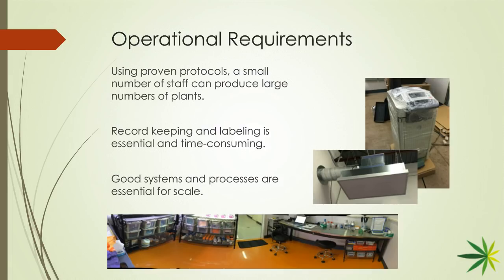Here's something we didn't touch on. I think this is a great question. How long on average does it take from putting an explant into culture to establishing it into veg? And I think that's always that big question. And so, what's our answer here for our audience? It's highly variable based on cultivar. I did mention that earlier. Some really liked being treated poorly this way, and they grow. And then others that are otherwise very robust growers in production were very reluctant to grow under these conditions. A range of 8 to 14 weeks.